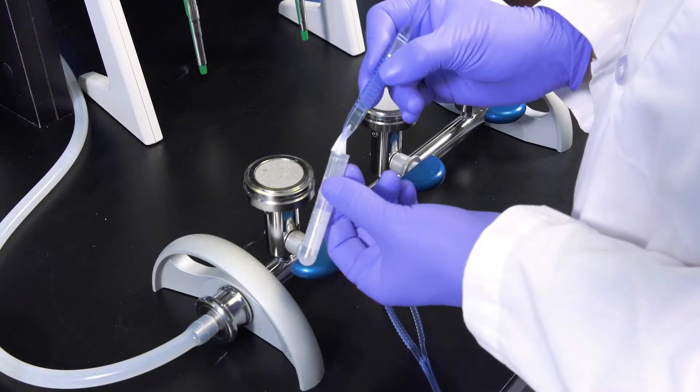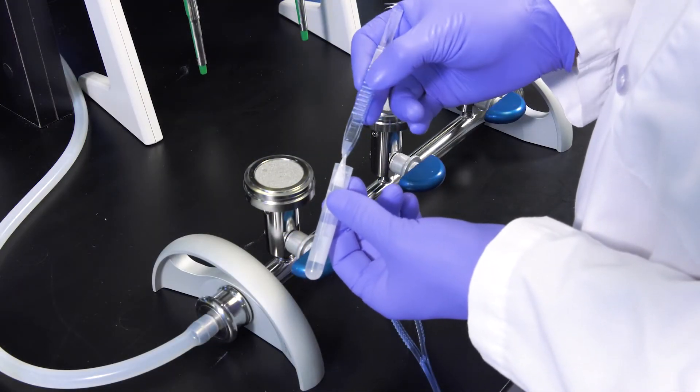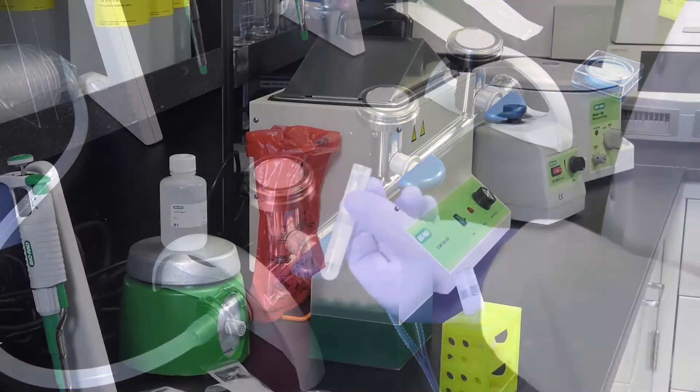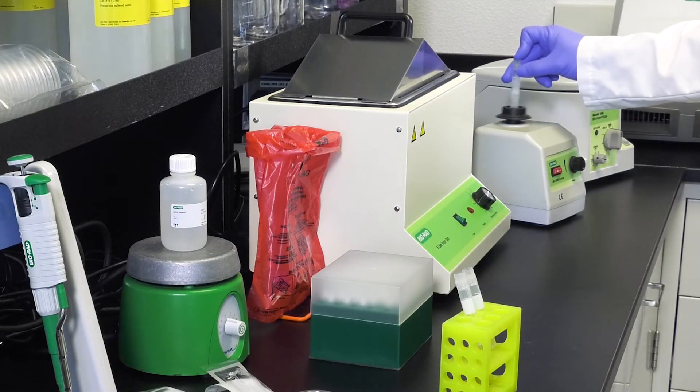Using tweezers, place the membrane in the cryotube containing two milliliters of R1 solution. Vortex for 20 seconds and check that the membrane is totally immersed in the R1 solution.